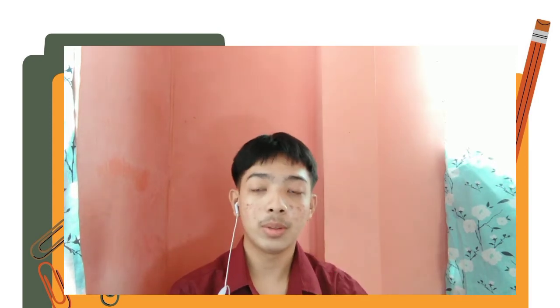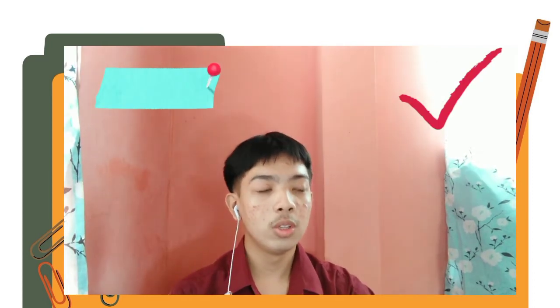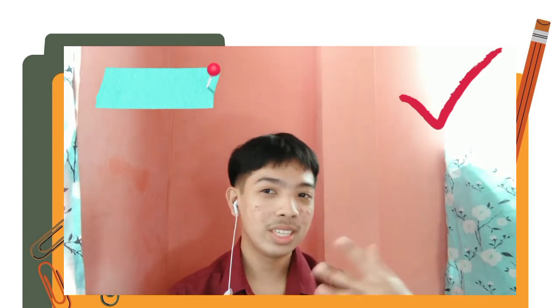Pinakita rin kung paano prepare yung ating mga apparatus and other materials doon sa ating pagsasample, pag-titrate dito sa ating vinegar sample. So it is important talaga yung maayos sa atin yung mga apparatus natin para sunod-sunod din yung process natin. And of course, kailangan natin record yung ating pagka-titrate dito sa ating vinegar.